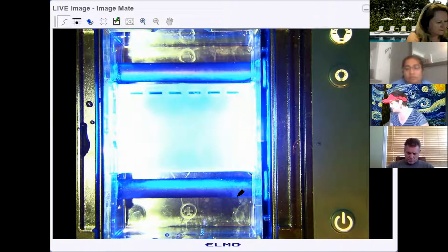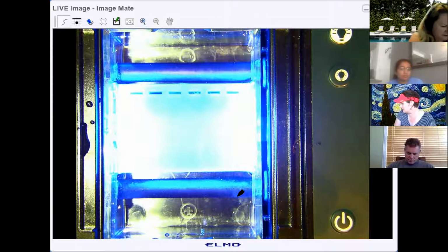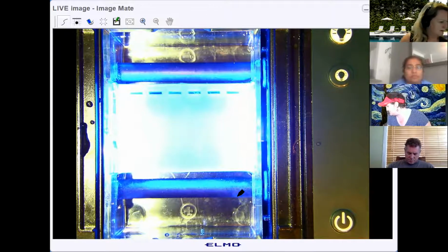I only used 6 wells for this gel, so I don't have room for Grandpa because I want to have the DNA marker. Actually, you know what? I do have room for Grandpa because I'm looking at the tube of brother number 2, and it looks like I don't have enough DNA in that tube, so I'm going to go ahead and put Grandpa in there. Oh, where'd Grandpa go? Okay, I don't have Grandpa's DNA, so we'll just do those. Okay, so I got my gel loaded up.